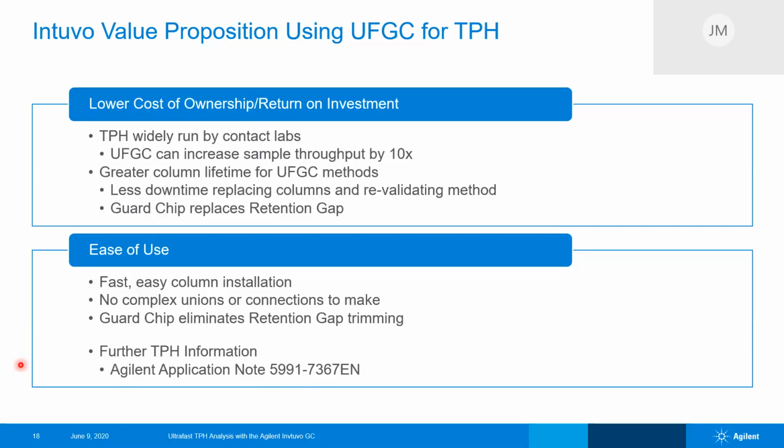Nitrogen, didn't really think about that. As you go to higher temperatures with nitrogen, it's a more viscous gas, and it requires higher pressures to push that through a narrow column. Our EPCs for capillary GC, although they can use nitrogen, they really can't deliver the high pressures that are necessary for higher flow rates at high temperature. And so I didn't really consider nitrogen for that.